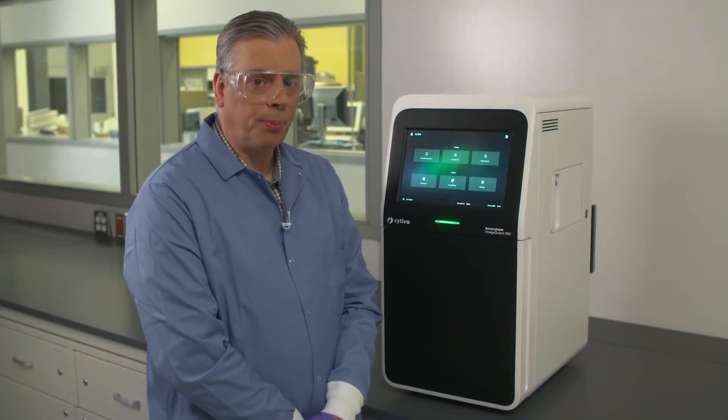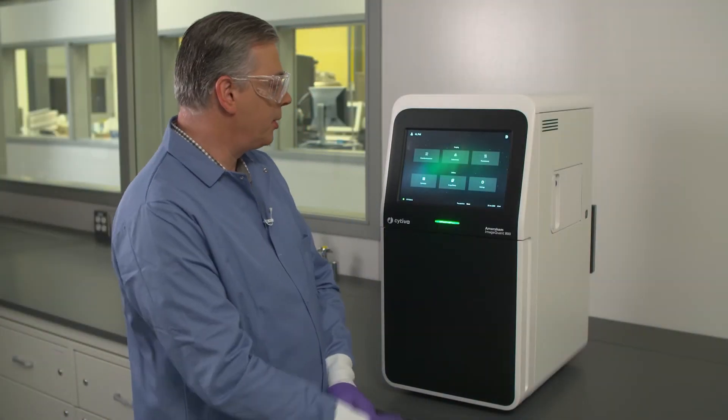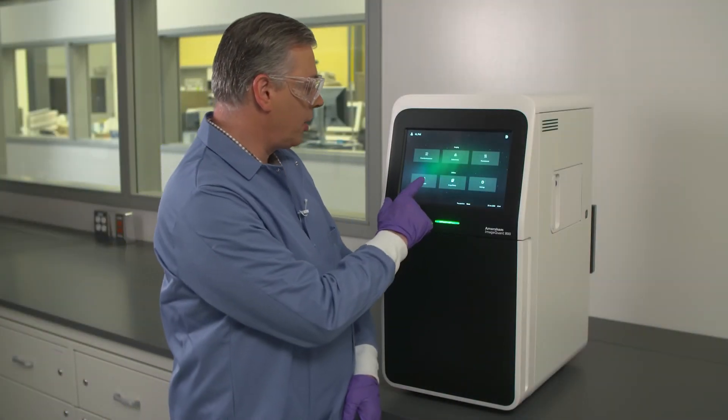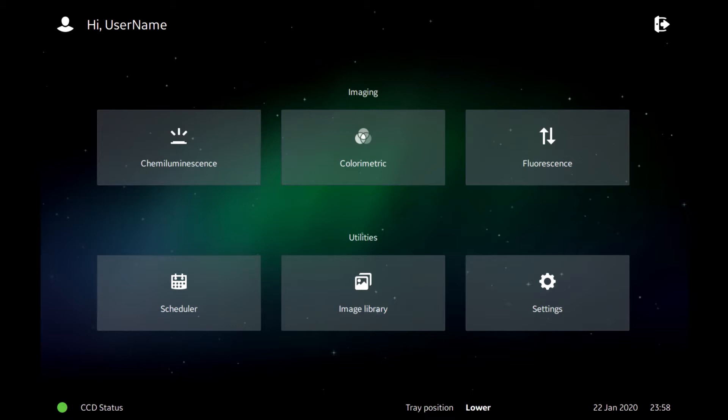Use the onboard scheduler tool to block time for your experiments using the ImageQuant 800. In this session we're going to look at using the scheduler tool.